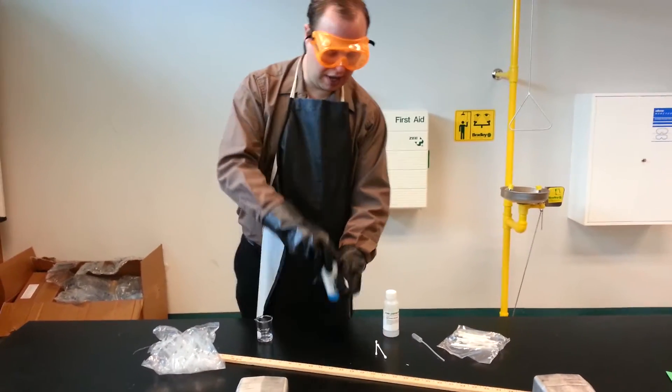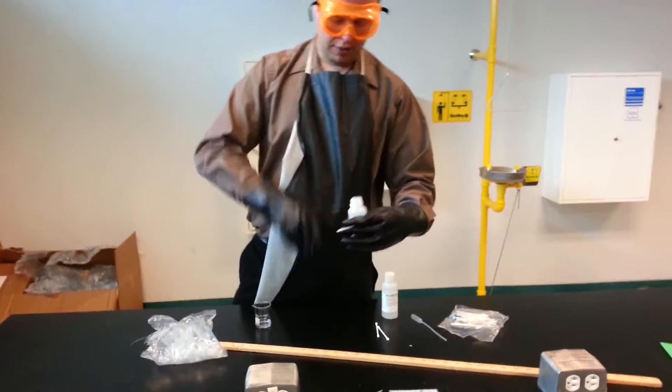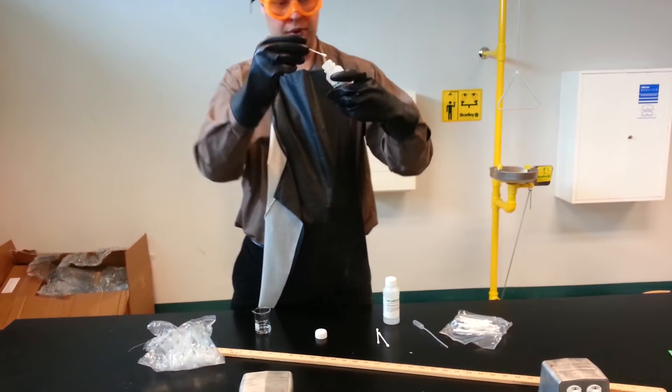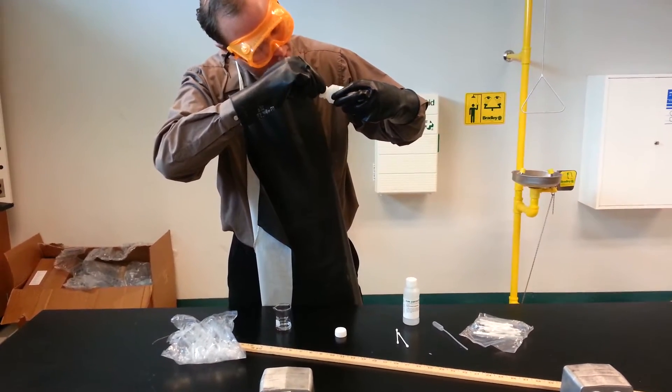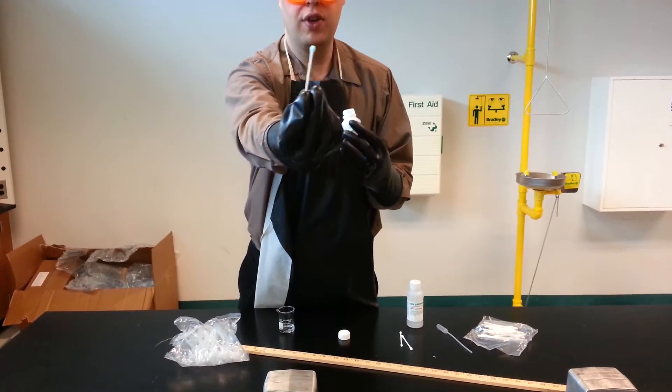What we're going to do first, we'll do the copper nitrate. I'm just going to take this Q-tip, touch the copper nitrate so the Q-tip has a little bit of solution in it. You can see it's blue right now.